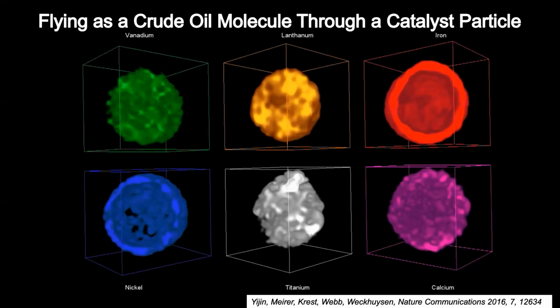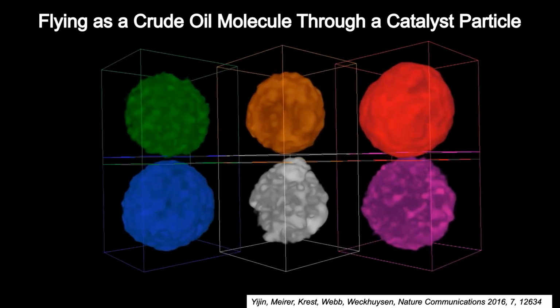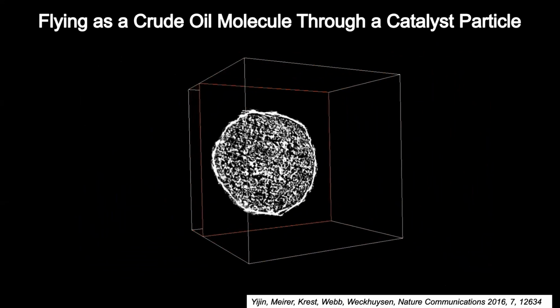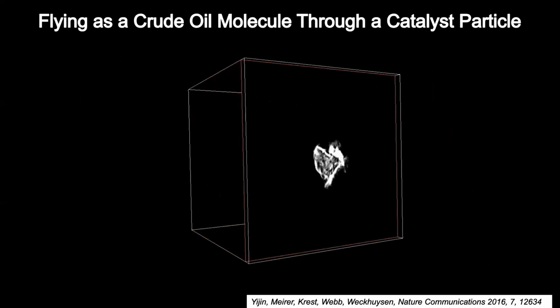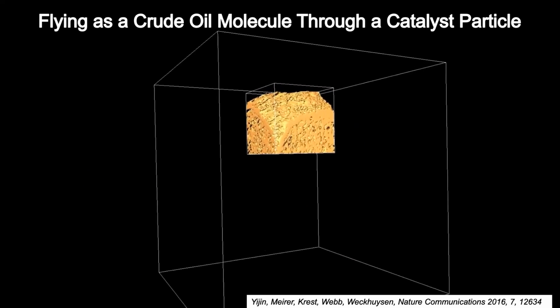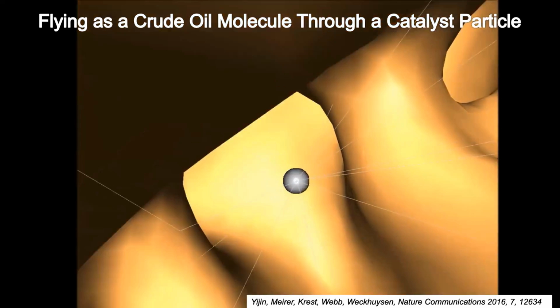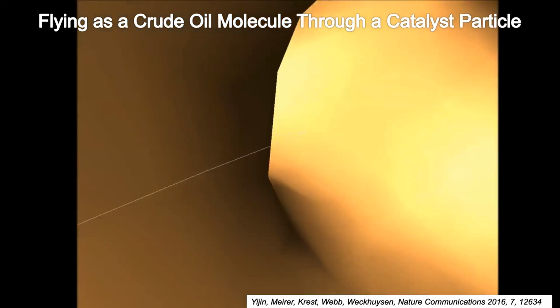And now we combine, so this is 3D. Spatial resolution is not that great yet, I have to admit. You will see that it improves over time. Now you have them all together. And now we say, okay, this is the porosity network in white and black. And now we see this reconstructed particle. We take an element, and this element, we dive into the thing that you have already done. Oop, here we are. And then we go through the pores. I like this, because it shows that you now can really go into it.